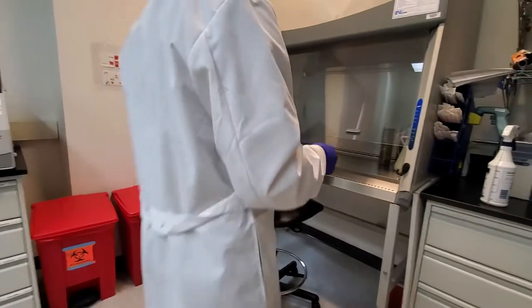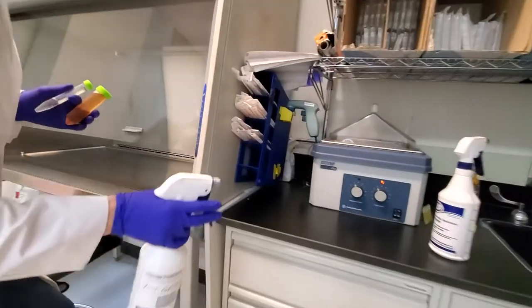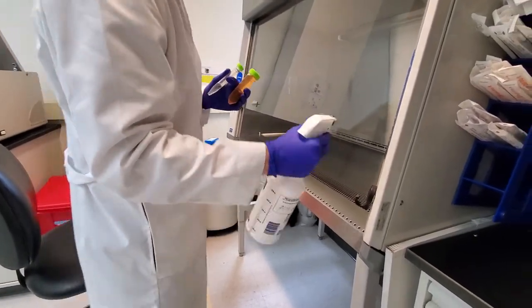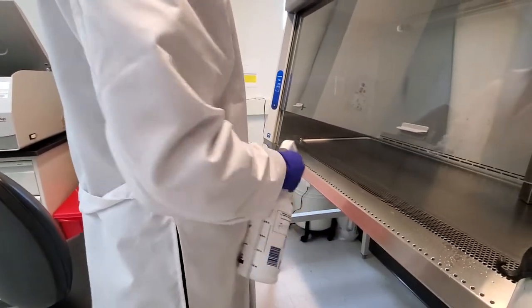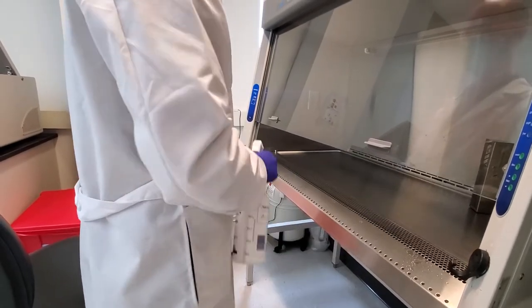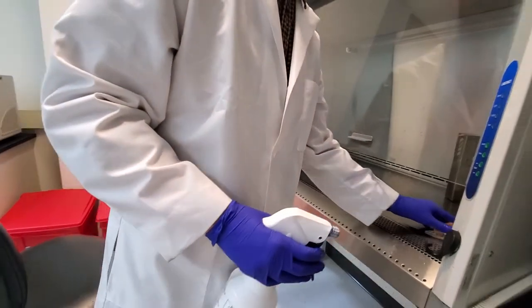So, open up the cell culture hood. We have bottles with 70% ethanol. Unfortunately, the sprays are sort of disintegrating, and the spray heads don't work so well. This one just sprays a lot of ethanol everywhere. Anytime you open up the hood, spray it down. Anytime you put anything into the hood, spray it down.